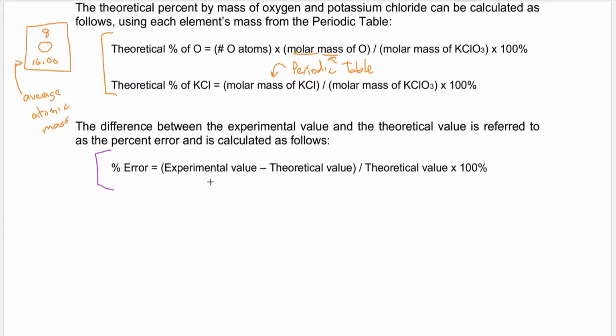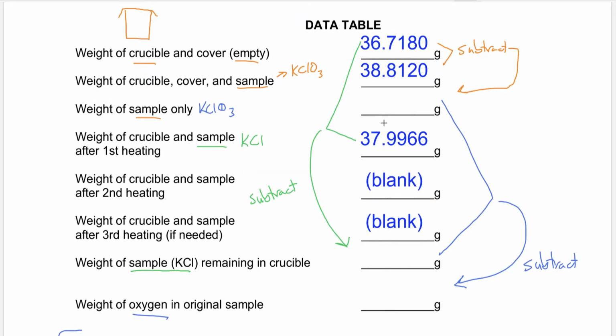And it's right here. And then notice the big difference is between the experimental value and the theoretical value. So the difference between those 2 values you calculate divided by the theoretical value times 100. And notice you're performing this subtraction first before doing the division. I can tell you for this particular lab, it's pretty small. The data you have here are pretty good, okay? And I think that's a decent overview for this lab. Thanks.